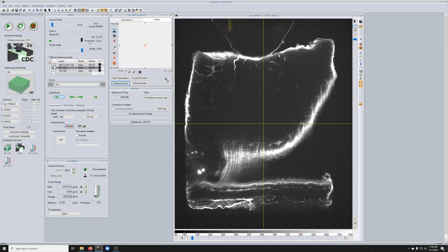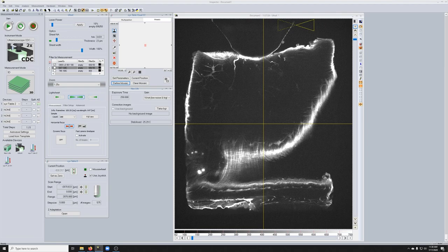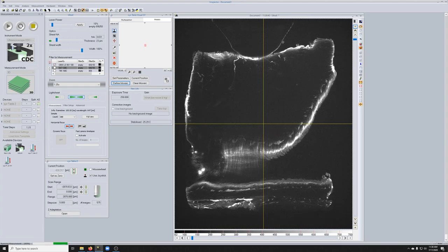And then what we can do in addition to make it more even is to lower the sheet NA to something like this, where on each side it will be more even. And so now if we do something like this, we have a much more even illumination throughout.